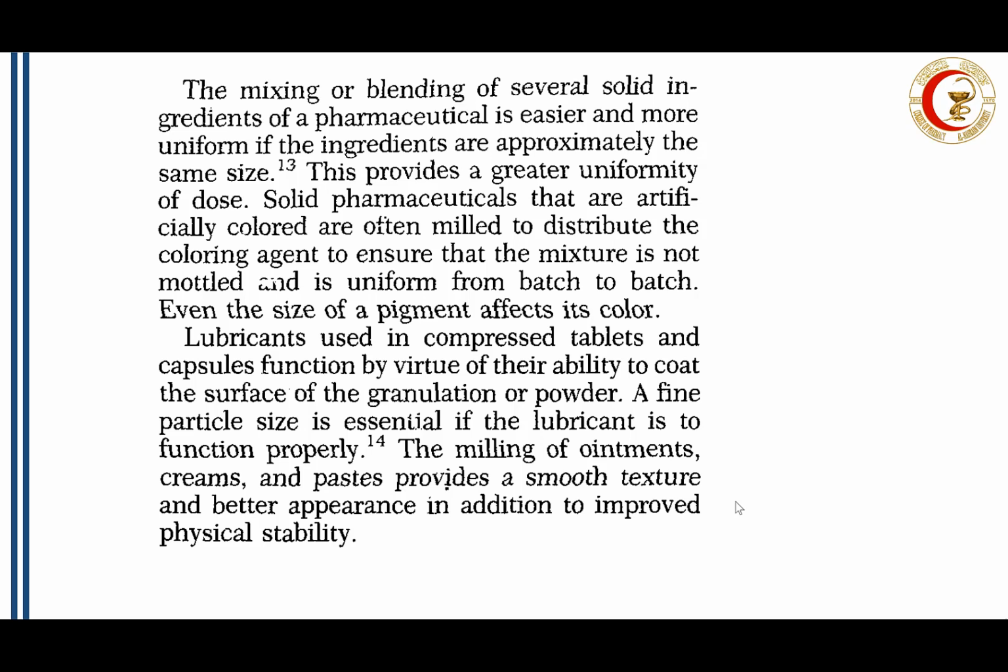Now, the milling of ointments, creams and pastes provides a smooth texture and better appearance, in addition to improving the physical stability. If I have an ointment with coarse particles, it will be irritating when rubbed on the skin. So I can solve this by milling the ointment with all the ingredients in it to get a smooth texture.